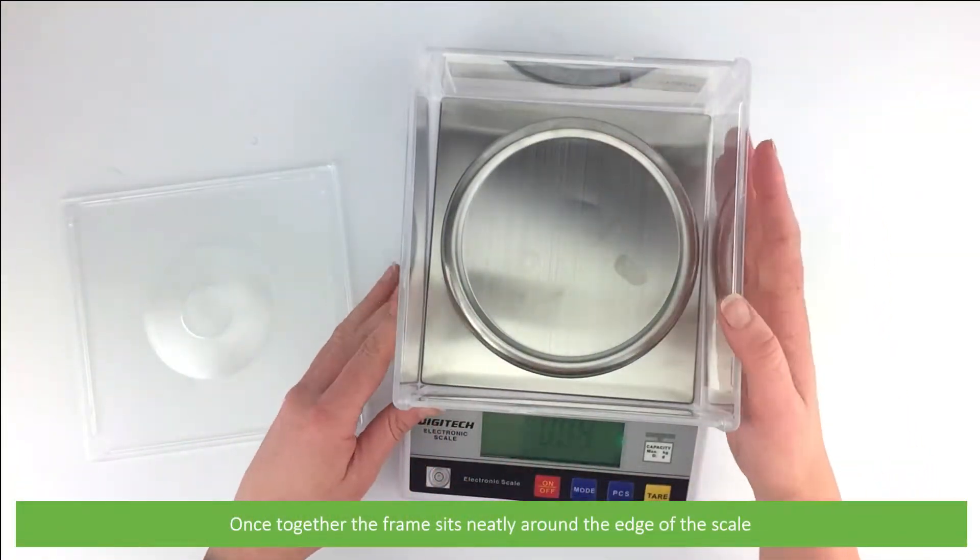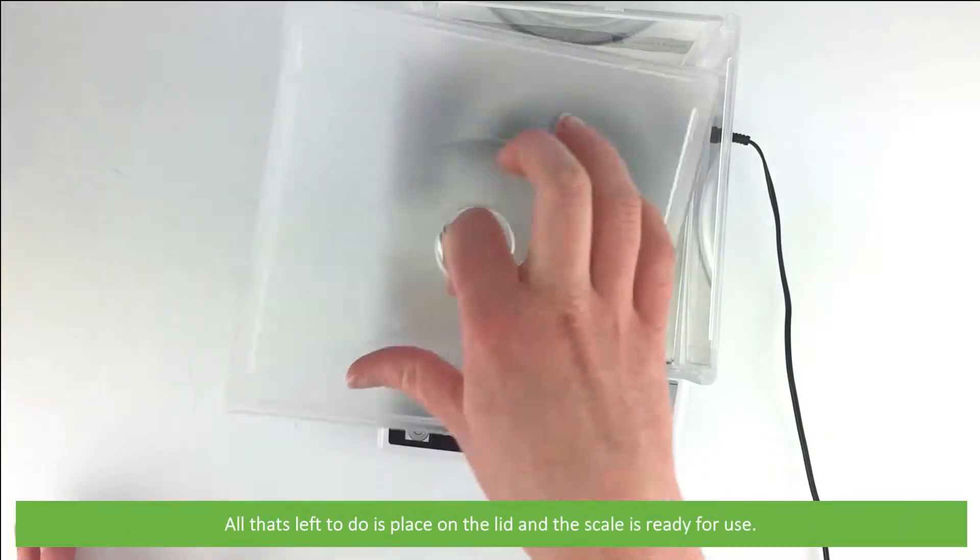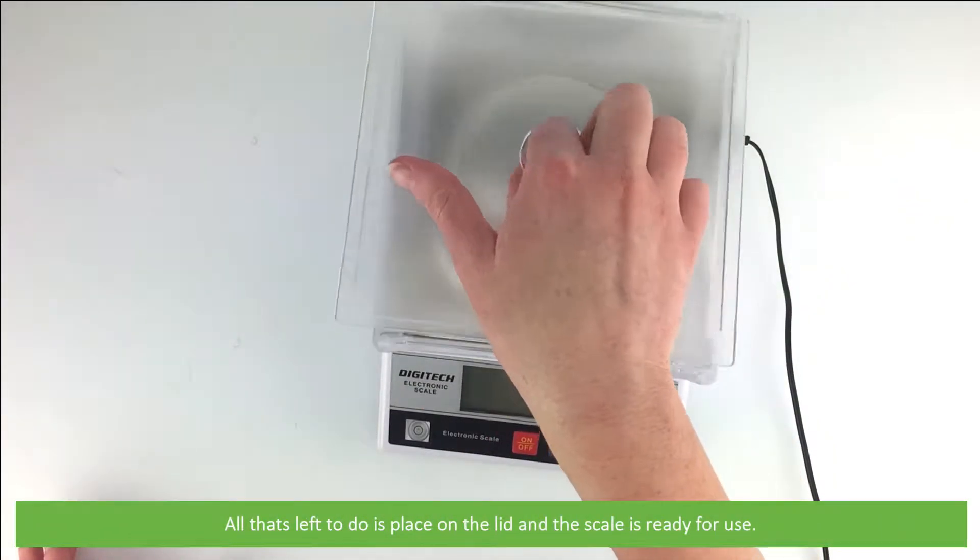Once together, the frame sits neatly around the edge of the scale. All that's left to do is place on the lid, and the scale with the walls is ready for use.